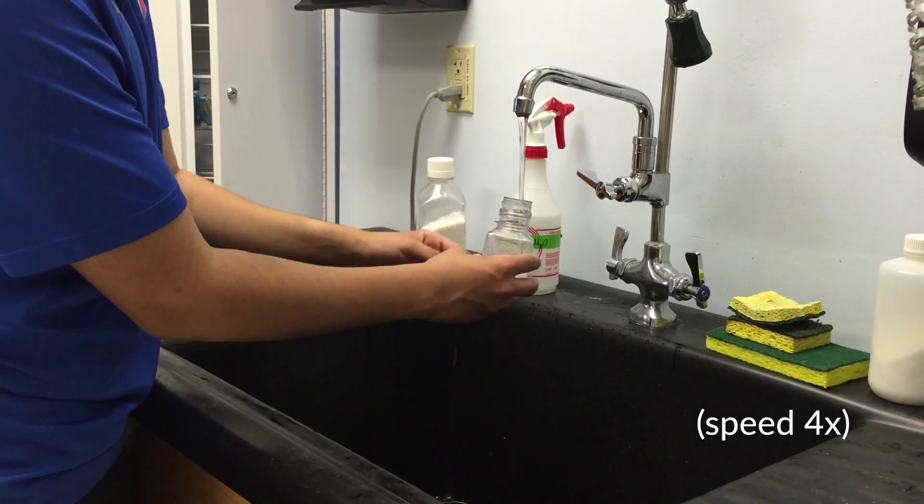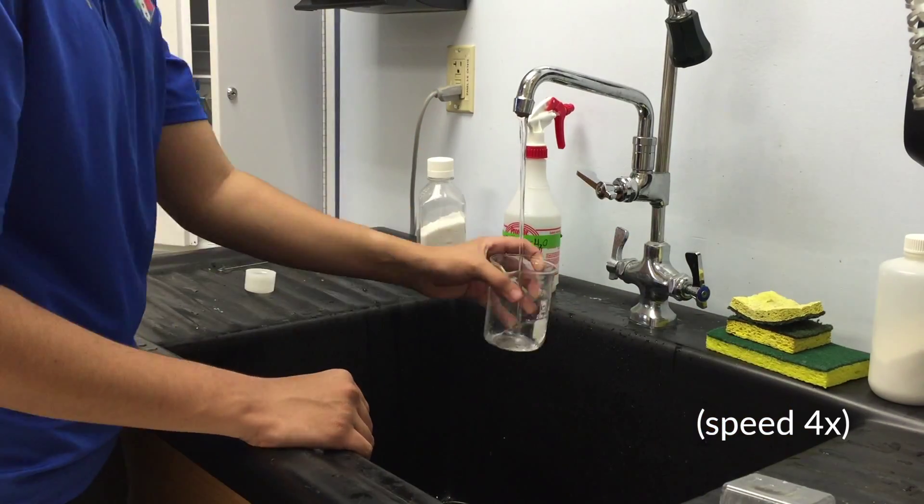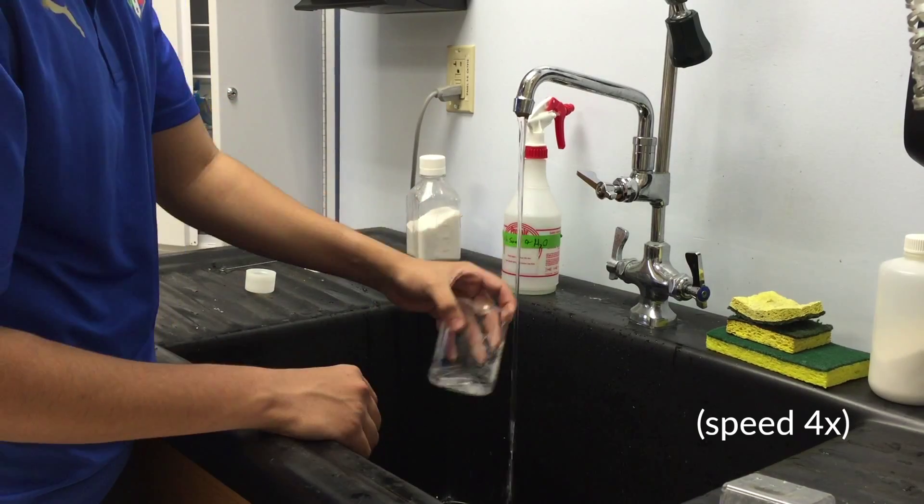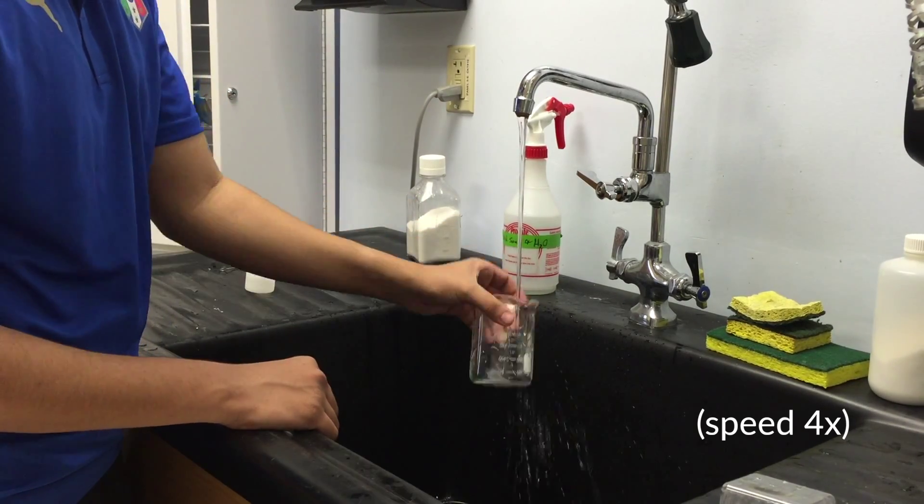On a side note, never put Alkinox into a volumetric pipette, as it is very difficult to get out and can damage the glassware.